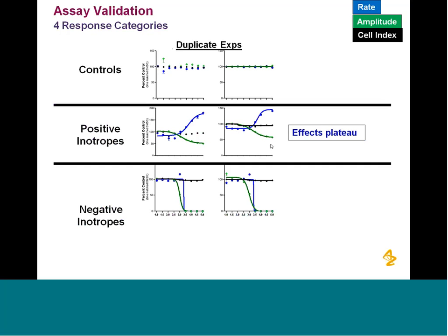Well, so we know that this is measuring contraction, right? So if you poison the myosin, the signal goes away, even though the action potential is still there. So it seems fairly safe to believe that this is a contraction that you are measuring. And the strength of that contraction seems to correlate with amplitude.